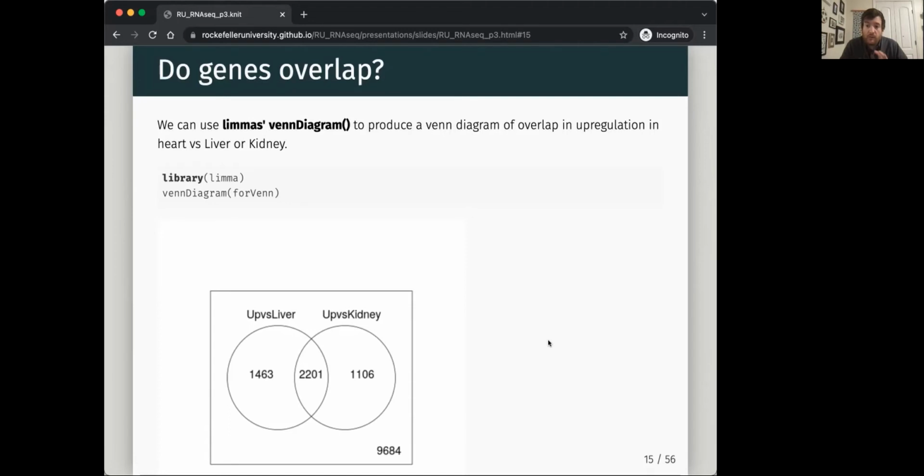And so with these kind of low level analyses, with these overlaps and Venn diagrams, things like cutoffs become much more important. And things like the quality of your data can actually infiltrate in and affect the conclusions. So it's something you have to think about and understand before you draw these conclusions. It's important to understand your data in a lot of detail. And that's why we show you how to look at things like the variance for these pairwise comparisons and things like that.